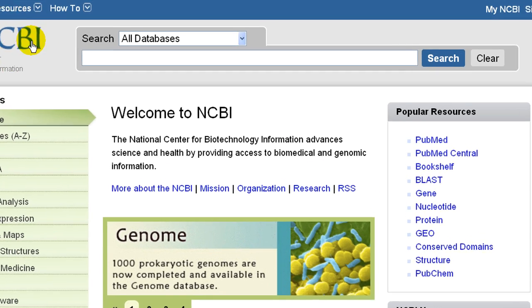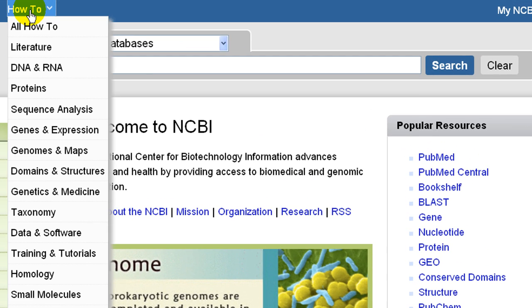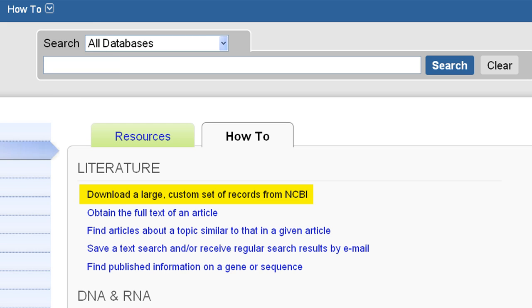This tutorial describes part of the how-to called Download a Large Custom Set of Records from NCBI. I'll describe two approaches to download records directly from your browser.